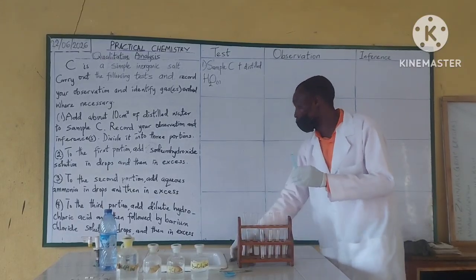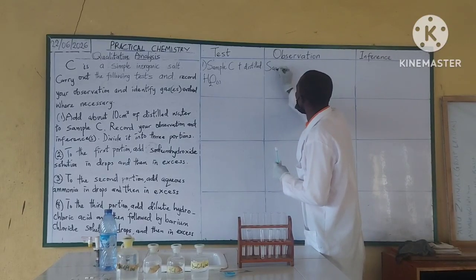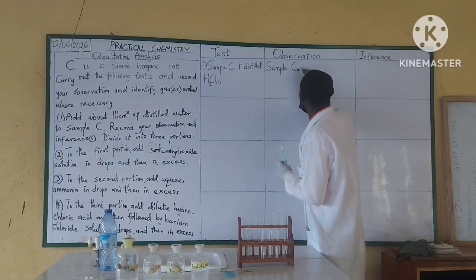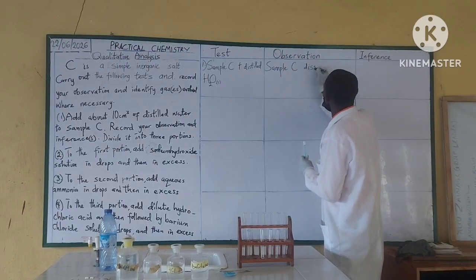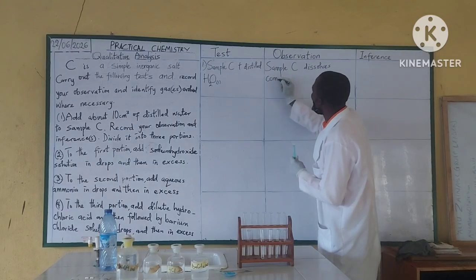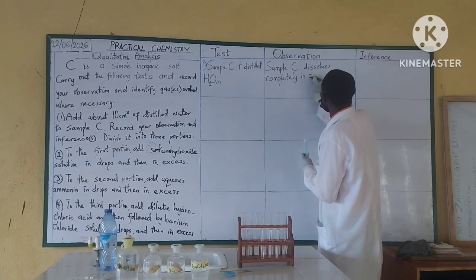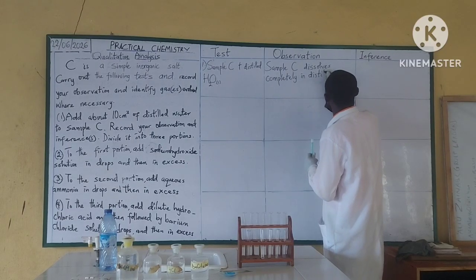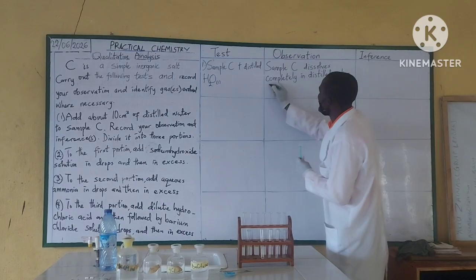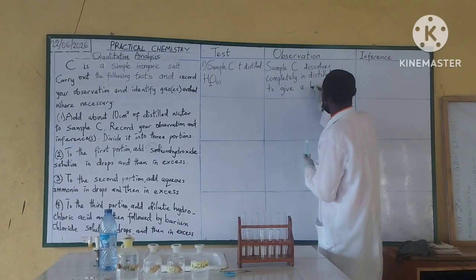Then we write: sample C dissolves completely in distilled water to give a blue solution.